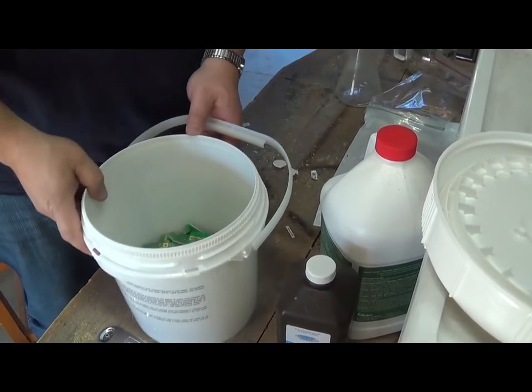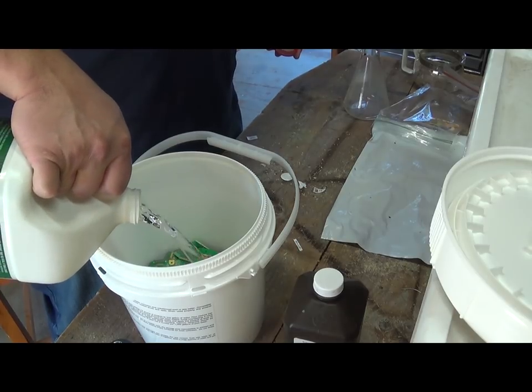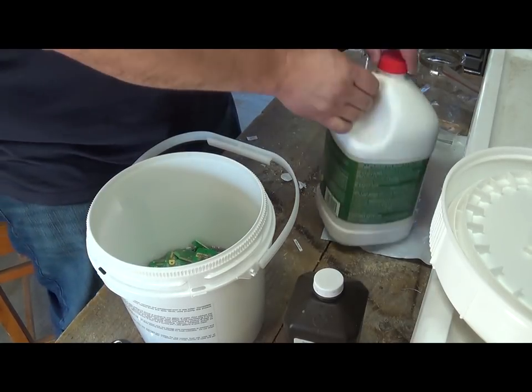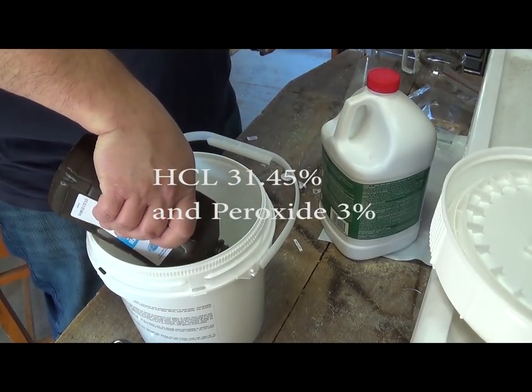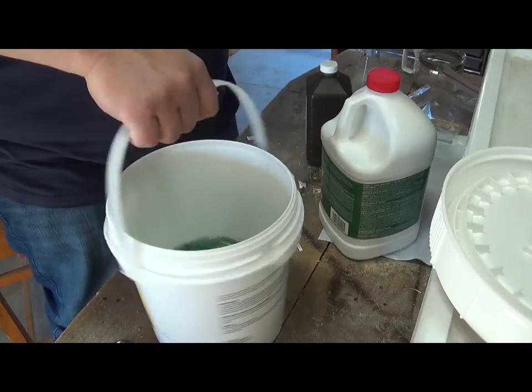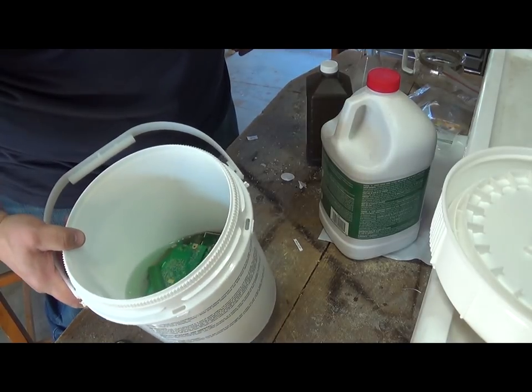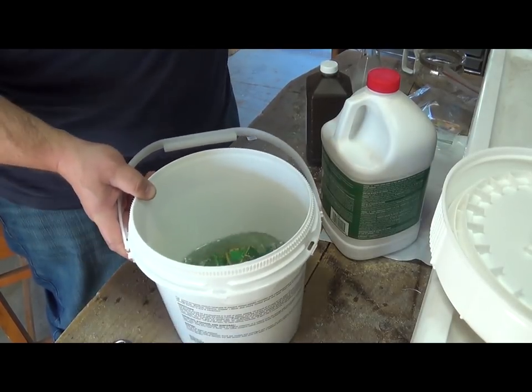We're going to do the same with this one. You pour in some HCl — just enough to cover — and then add in the peroxide. Once you start seeing a little green in the water, that's the copper dissolving, the reaction is starting, and you really don't need to add anything else.